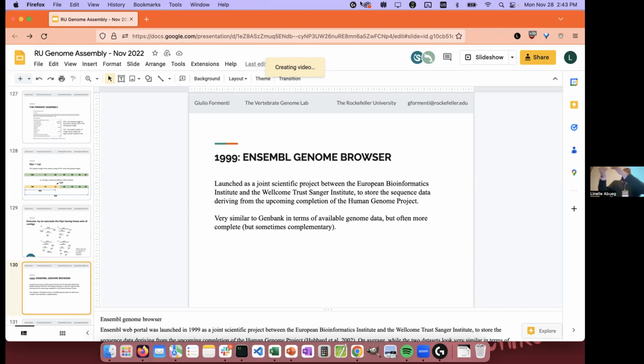So the gaps in the scaffolds represent unknown sequence, but because the overarching goal is to reconstruct the entire chromosomes, we allow gaps, but at least we know the order and orientation of the sequences within the larger chromosome, even if we don't know exactly the entire sequence. Does that make sense? Okay.